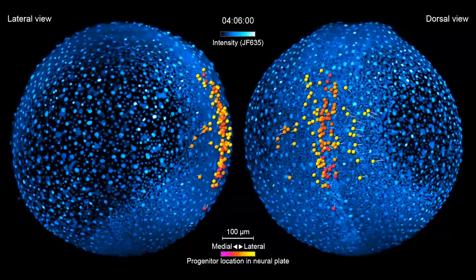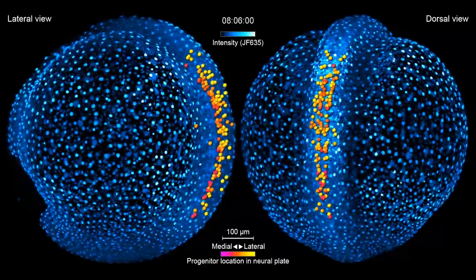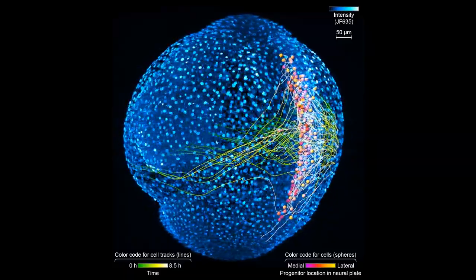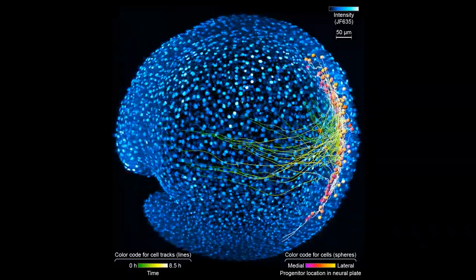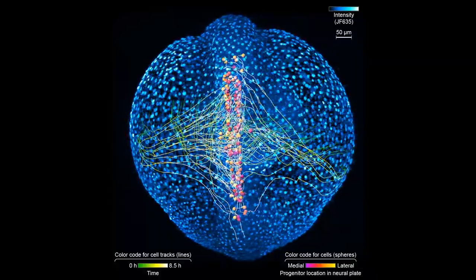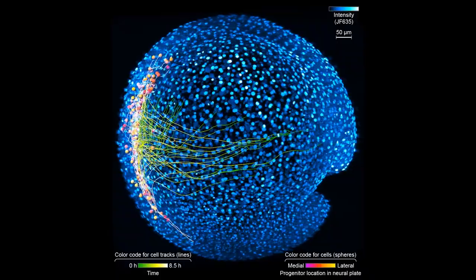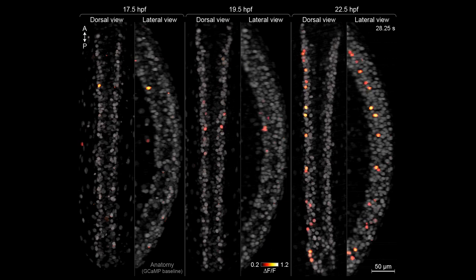We first imaged the development of the entire zebrafish embryo at the single cell level until 17 hours post-fertilization. Using these images, we tracked the neural progenitor cells as they form the spinal cord. As soon as these progenitor cells start to differentiate into neurons, we rapidly switched to high-speed functional imaging of the spinal cord in order to record the neuron's activity.